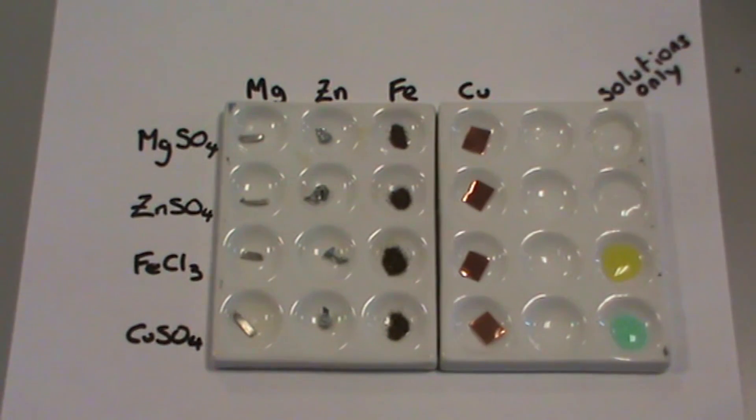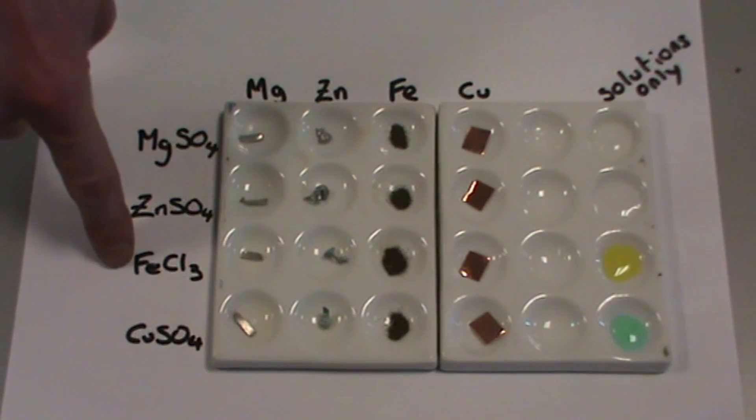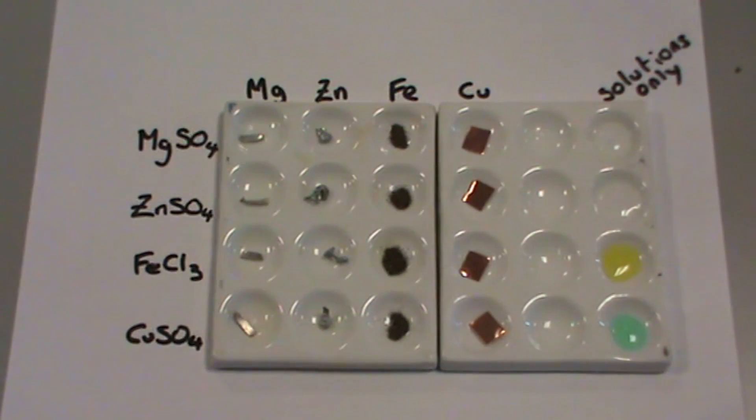We've tried to use a similar quantity of metal for each well, and we'll try and use a similar quantity of solution in each well. You may notice that iron chloride is not iron sulfate. Ideally, we should use the same salt solution for each well.